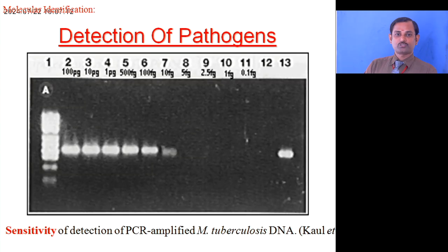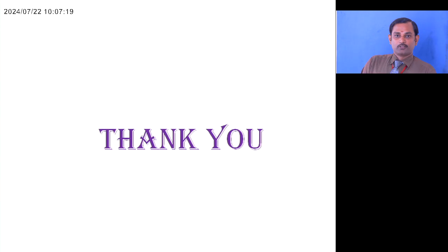This picture shows the PCR product, how the PCR product will appear in the electrophoresis. So this is about the PCR technique. This technique is used in different fields. Thank you.